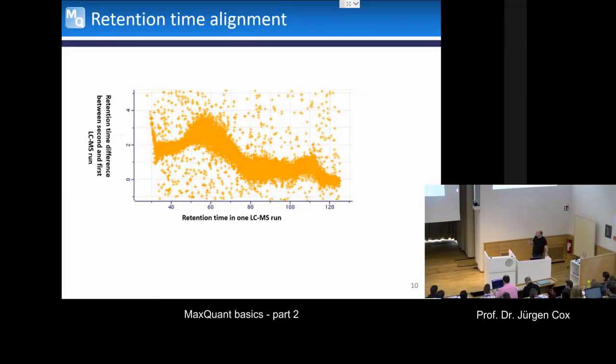No, forget about this. So actually, the time window of 5 is just to find where the curve is actually residing. And so there are two time windows that are important here. So the first time window is like the large scale. So that tells you where it is actually looking for the alignment function, right? Or what is actually the largest misalignment that happened? So when did it go the farthest apart? That could be 10 or 15 minutes or something like this, right? And this is the alignment time window.